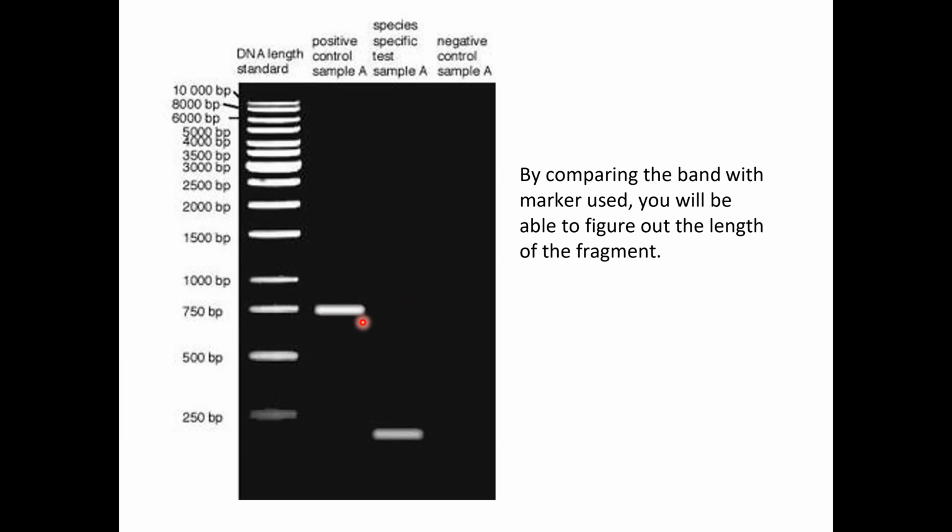So there are some instances, there are factors, that mean you didn't properly put the sample, or there will be a problem or contamination of your sample. In such cases, we need to repeat it or confirm it, because when you present this in public, people may say, oh, you ran the gel improperly. So it invalidates the results as well. So we need to rerun it or measure it using a nanodrop.